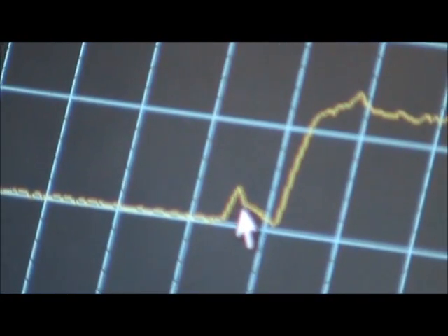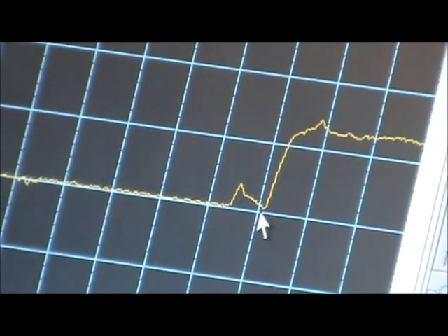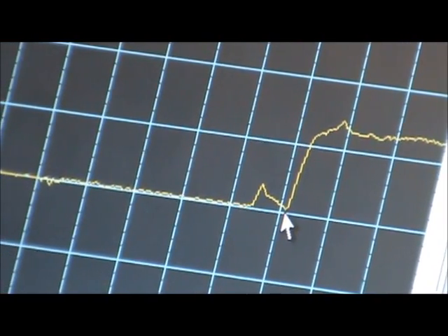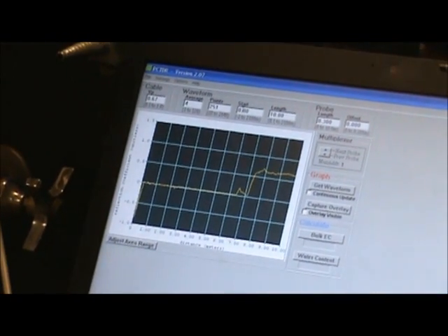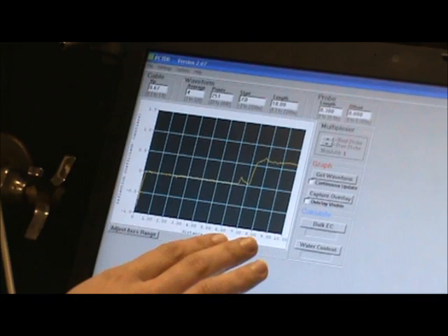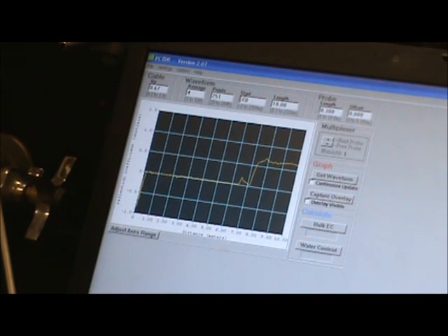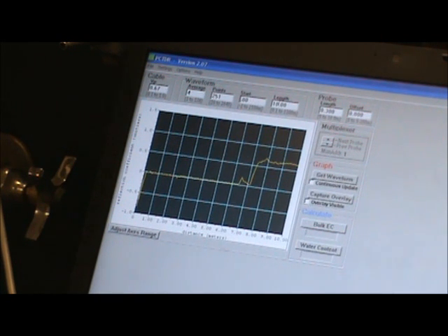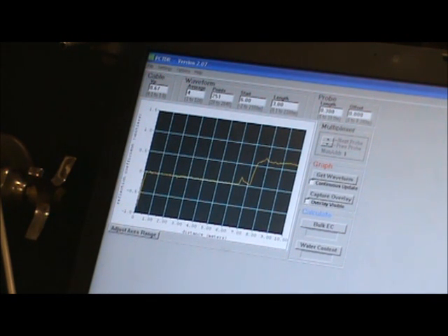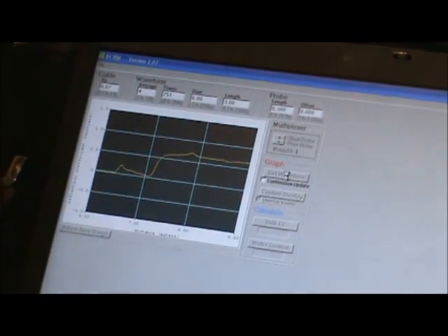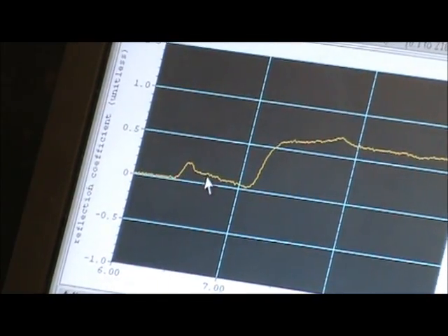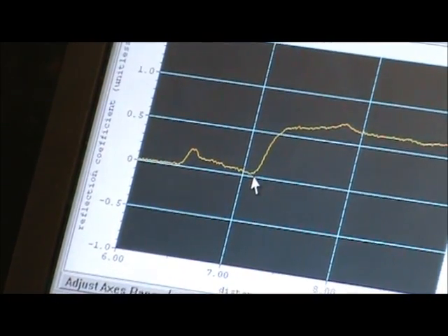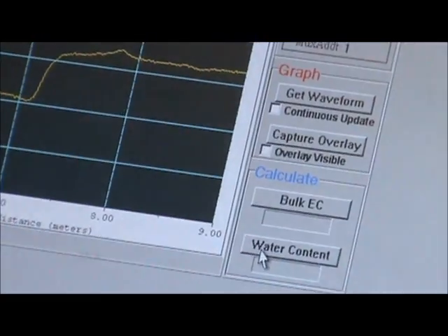Then right here, it's traveling down the metal rods, and it reaches the end of the rods right there for the TDR. So we want to zoom in on that portion of the signal, and it looks like it's about between 6 and 9. So see here, we've zoomed in. Here's where the signal hits the soil, and here's where it gets to the end of the rods. So we want to calculate the water content for that section.